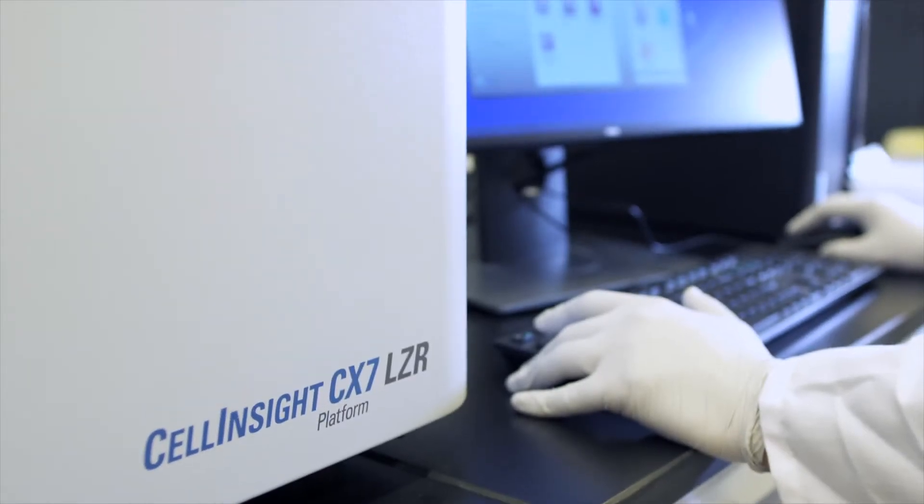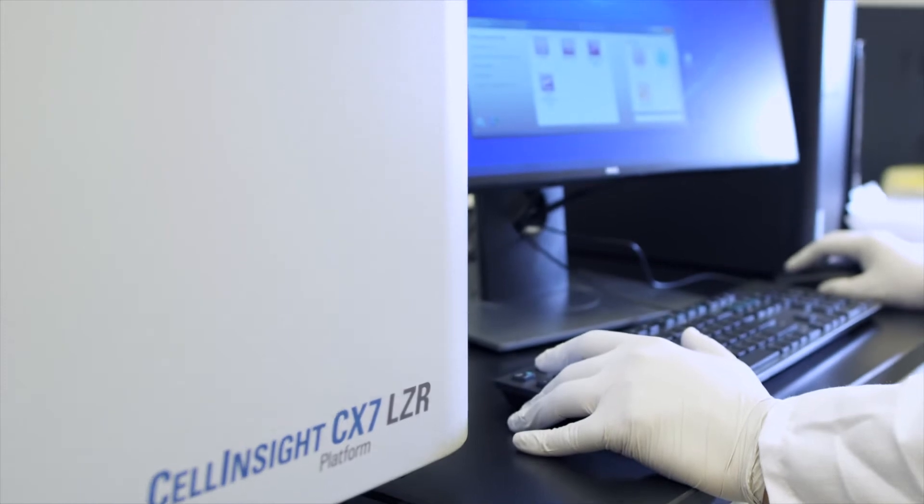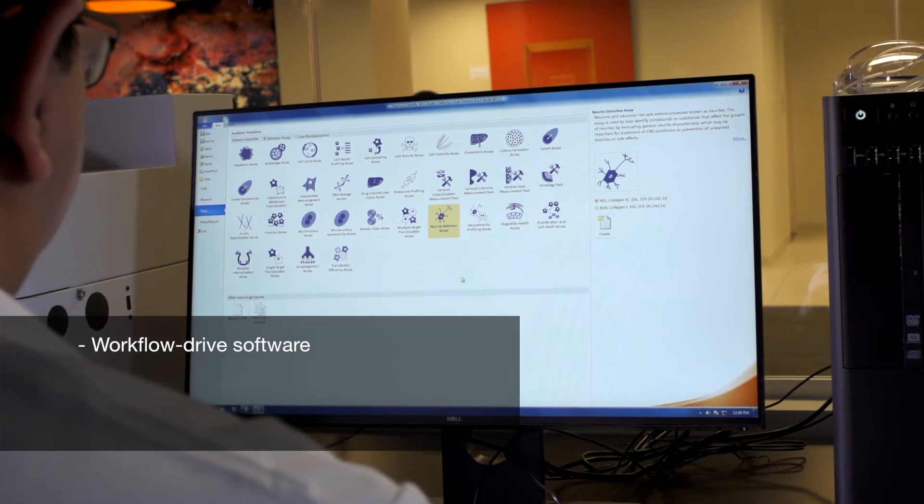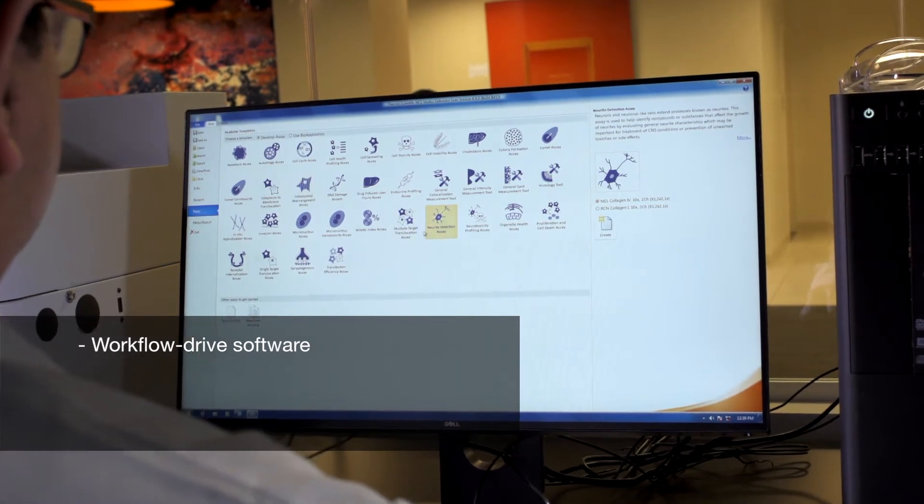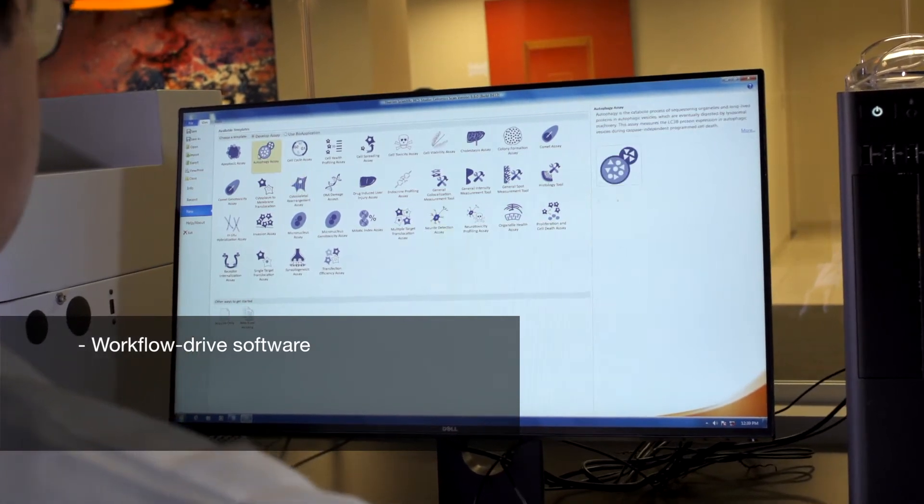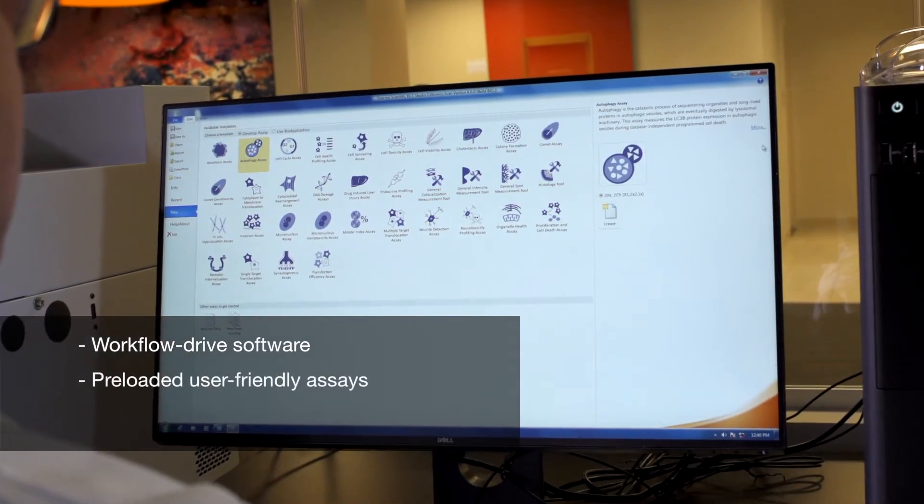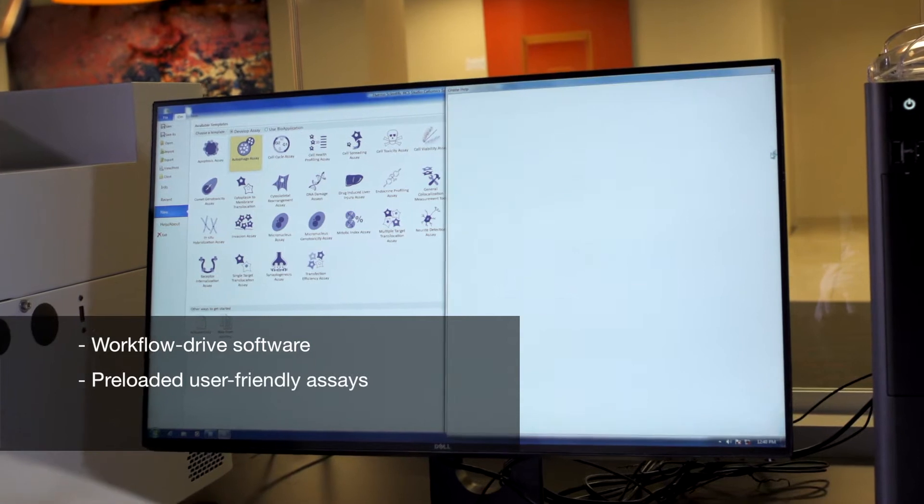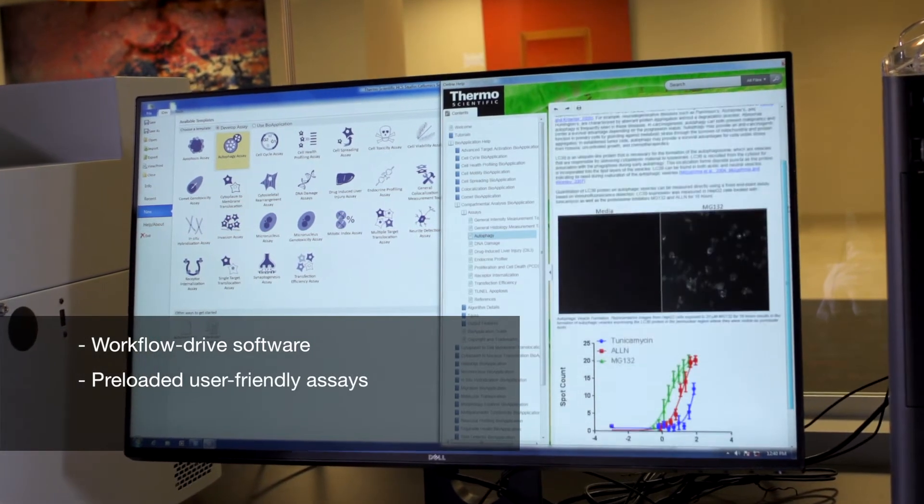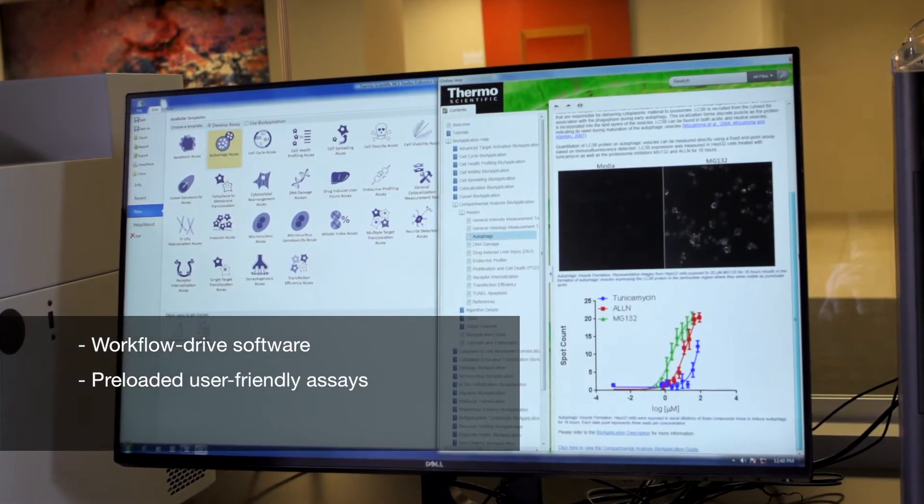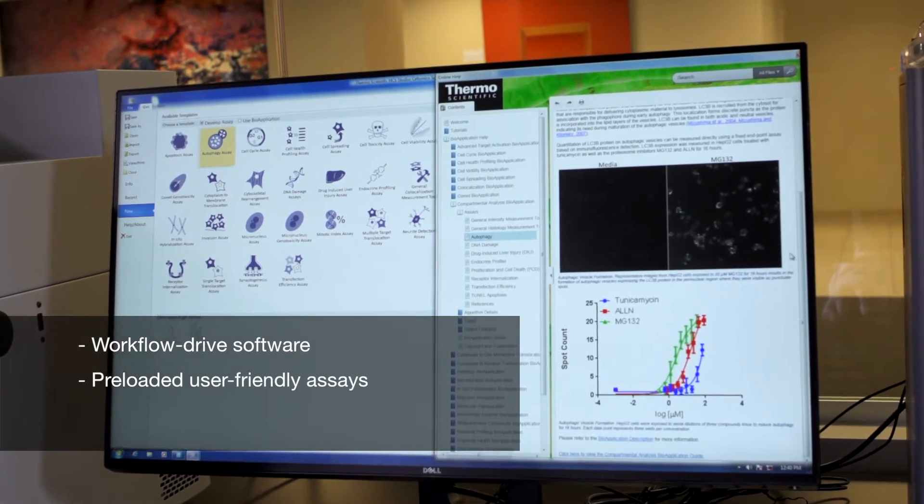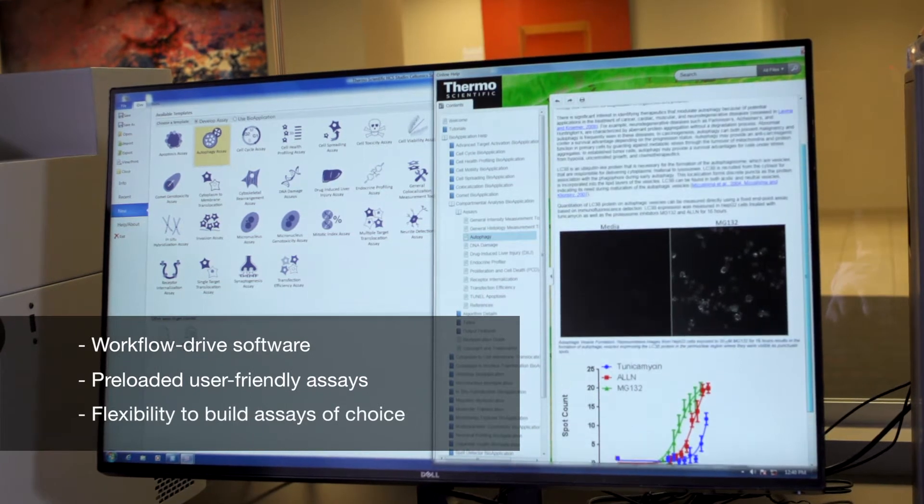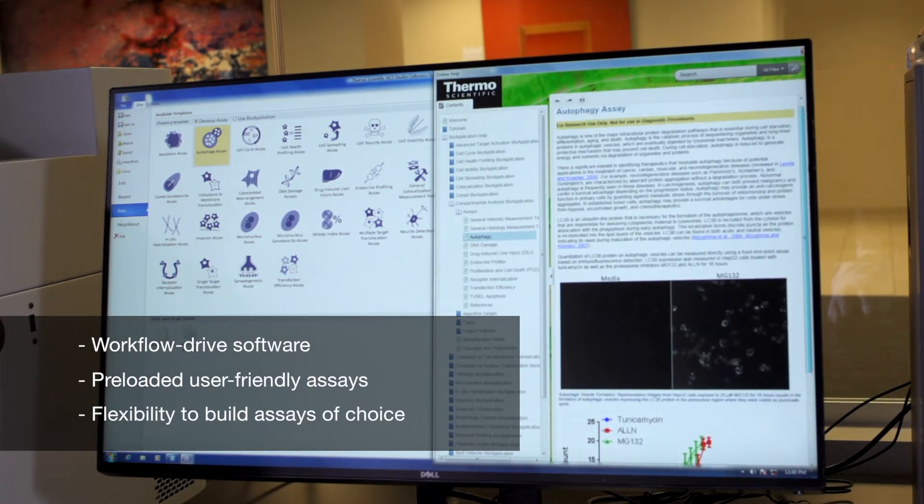All of our high content instruments are powered by our HCS Studio Cell Analysis software, a powerful workflow-driven imaging and analysis suite, which allows you to access a user-friendly icon-based suite of preloaded assays related to your cell analysis research, while also giving you the option to build your own assay of choice.